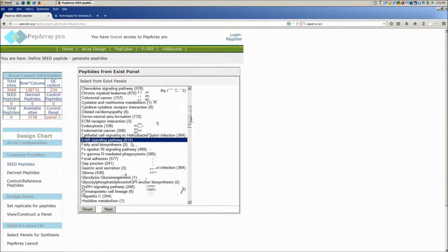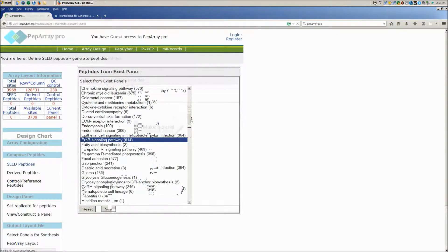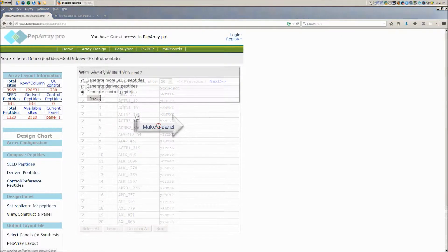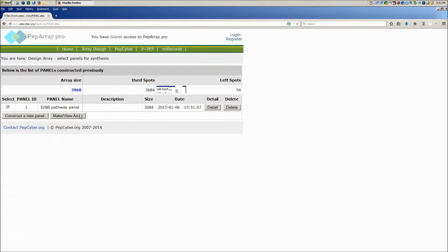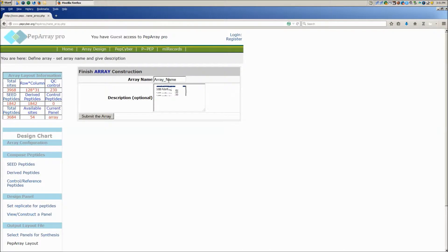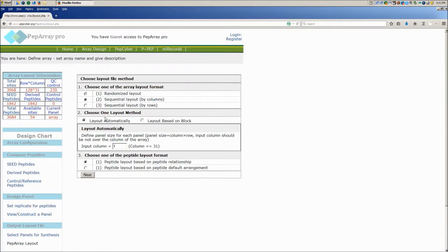Simply select the pathways, generate the panel, generate the array, and export the layout file.